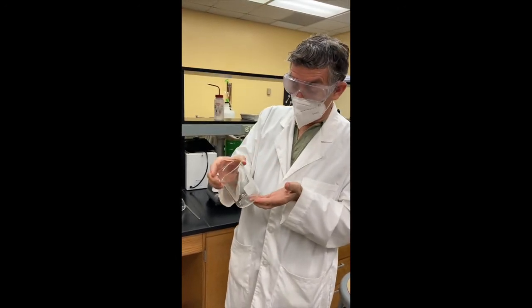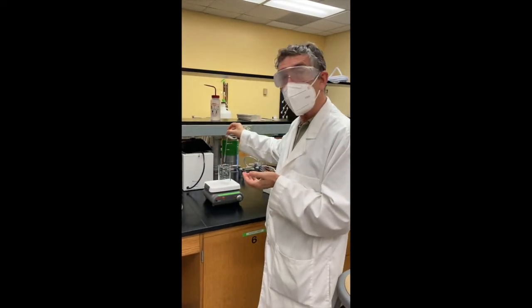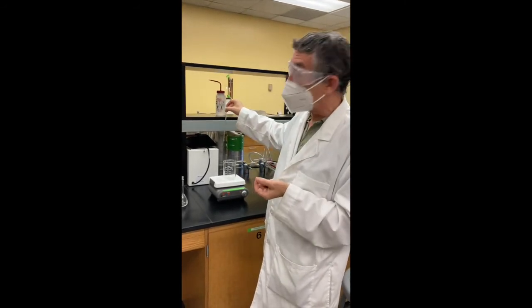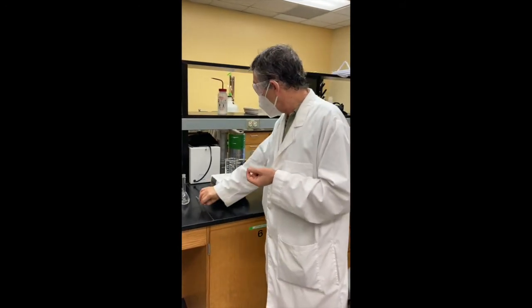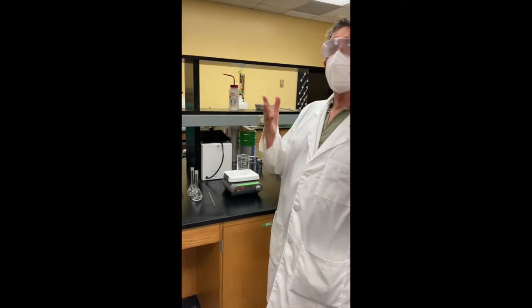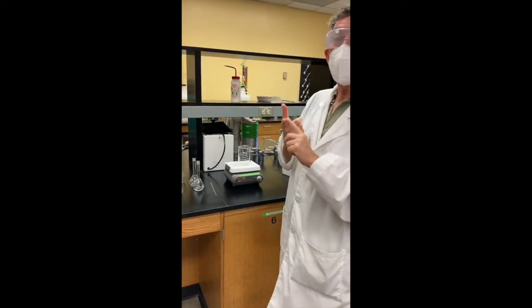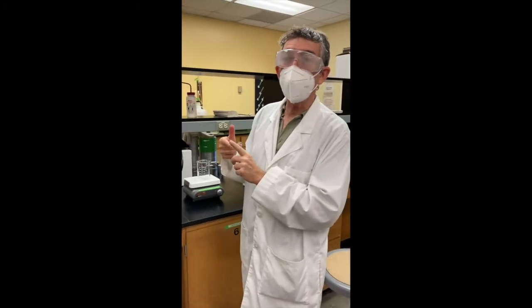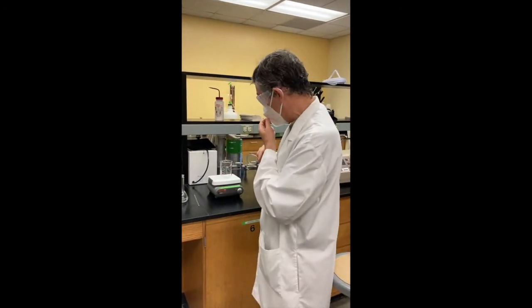So often people will not use a stir bar, and instead will simply stir with this glass rod. If you do use a stir bar, you'll have to be very careful that you get all of the polyvinyl alcohol off of it. One thing to remember as you do this experiment is that any residue of the solution, as it evaporates, will leave a film. You can lose some polyvinyl alcohol in that film. And secondly, as we'll see shortly, that film can clog the instrument we use to measure the viscosity. There's a small bore, as you'll see.